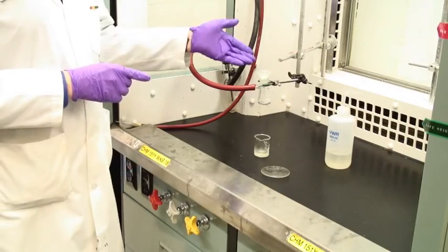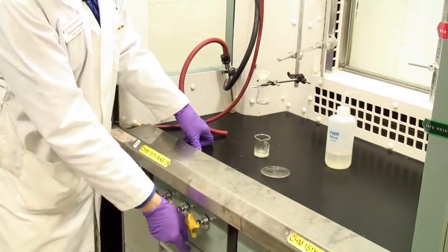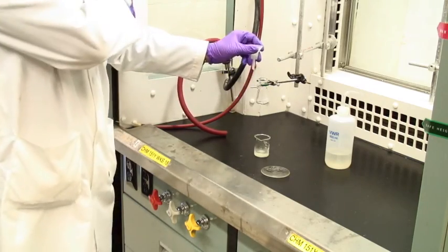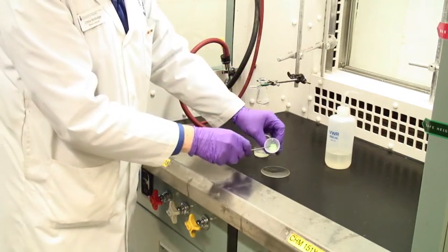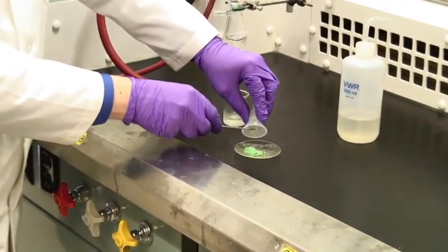Once you're done, it's pumped dry, then disconnect the vacuum, turn the vacuum off here, and remove the Hirsch funnel. Take your spatula and transfer the solid onto a watch glass.